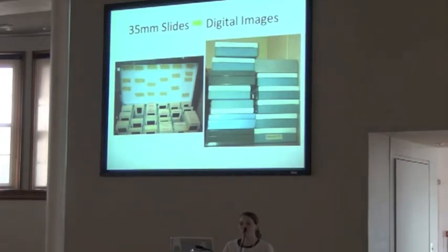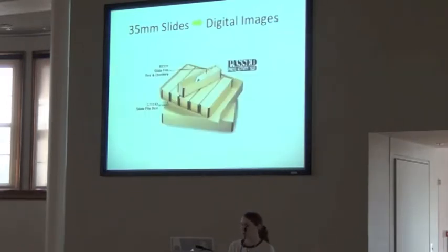The easiest way for us to do it was by island and by year. But as we found piles of slides in various locations, we had to adjust things as we always do with collections when new things are added. And these slide boxes were not ever intended to be a long-term storage program. And we eventually purchased these modular slide organizing systems, which are archival.